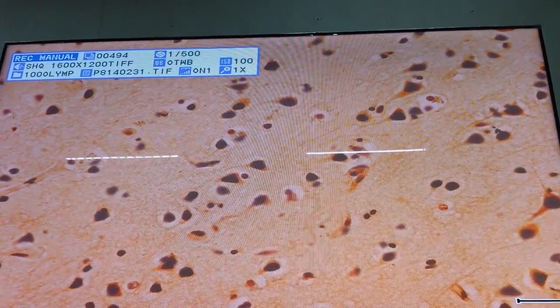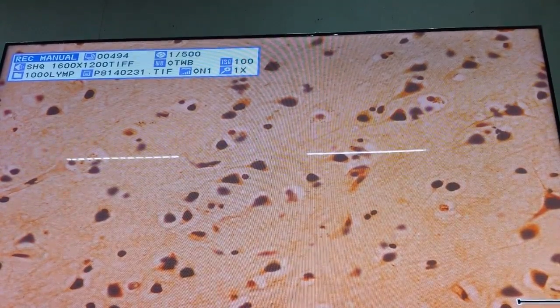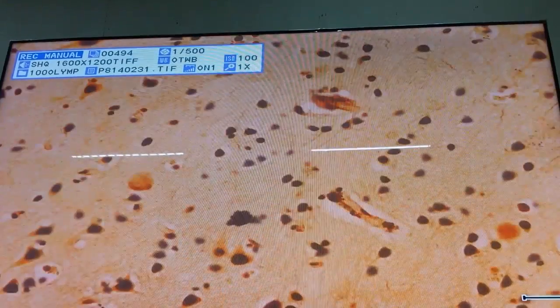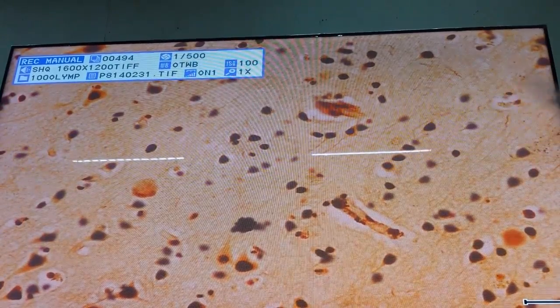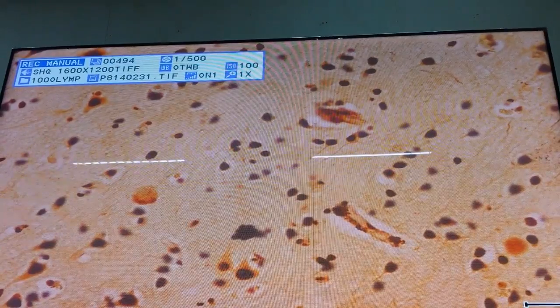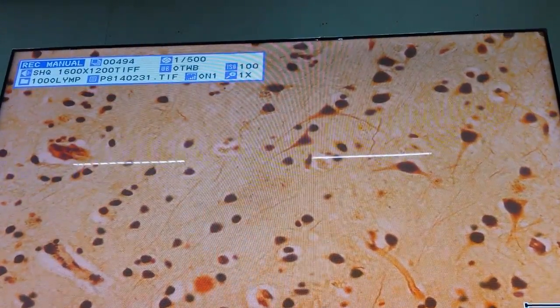where we would see the presence of pyramidal cells, but sometimes it's indistinguishable from the second layer. Then the fourth layer, you can see less of the pyramidal cells, more of the granule cells. That's the internal granular.